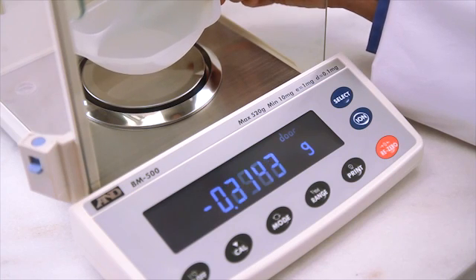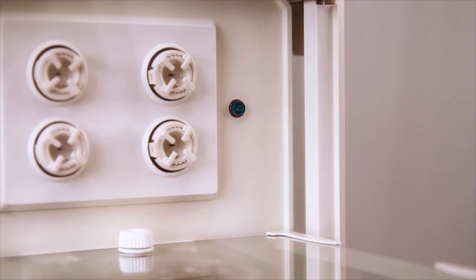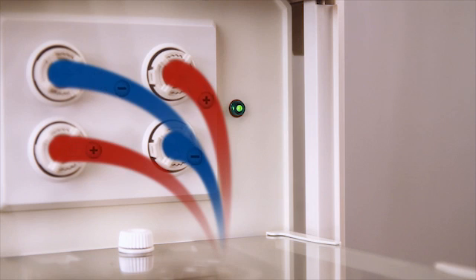Here, the display value is rapidly changing. Because static can seriously compromise precision weighing, A&D decided that the fanless DC ionizer is the best technique to eliminate this problem.